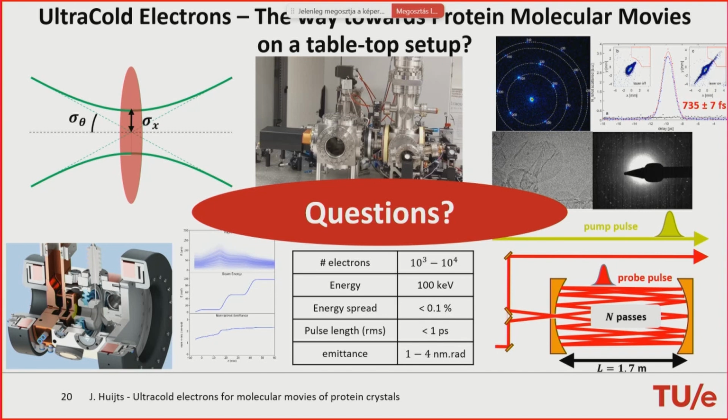But I think it would be really, really cool to combine these techniques. And I think the best way to get, for many proteins, really large but very thin crystals would be that cryo-FIB milling. And just one tip: we have a gallium one at ASU, and it's no use because too much damage to the sample, but they have now these plasma FIBs. And with them you can really much more mildly also mill much larger areas.